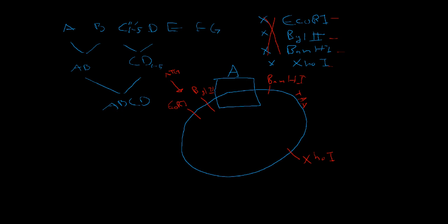We also have a few primer sites. We have the CA998 primer. That's a forward primer. And then we have a reverse primer, and this is not to scale. This is the G00101 primer. So this is our plasmid, and this is an awesome plasmid.